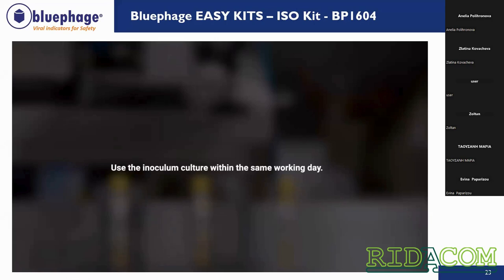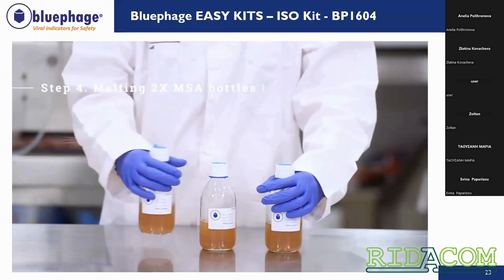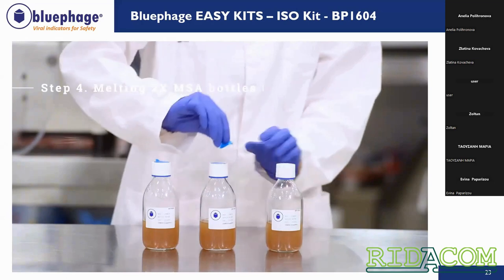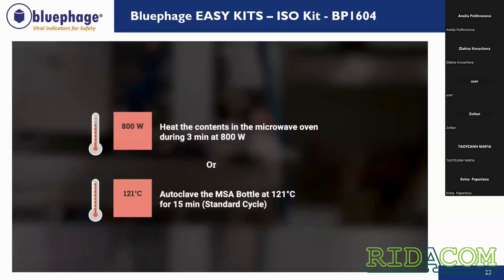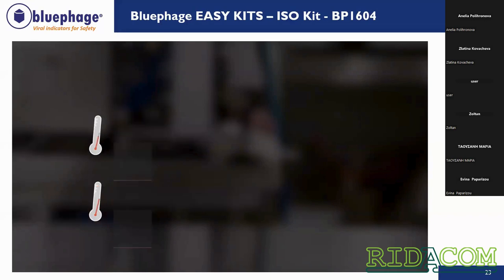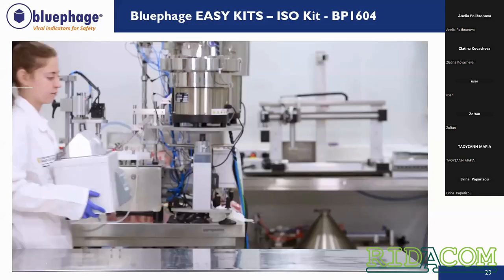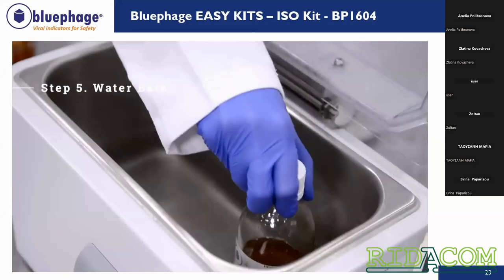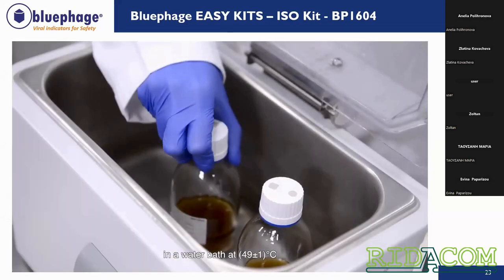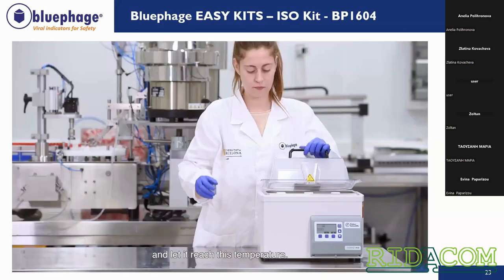Meanwhile, we have our inoculant culture in the incubator. We will melt the 2X MSA bottles. This is a very rich media. To melt it, it's highly recommended to use the autoclave, standard cycle, or a microwave. These bottles are prepared to be used in both systems, so there is no problem with that. It is really important that the 2X MSA is completely melted, completely liquid. Once it is melted, we put it in a water bath at 49 degrees. And now we will prepare our samples.